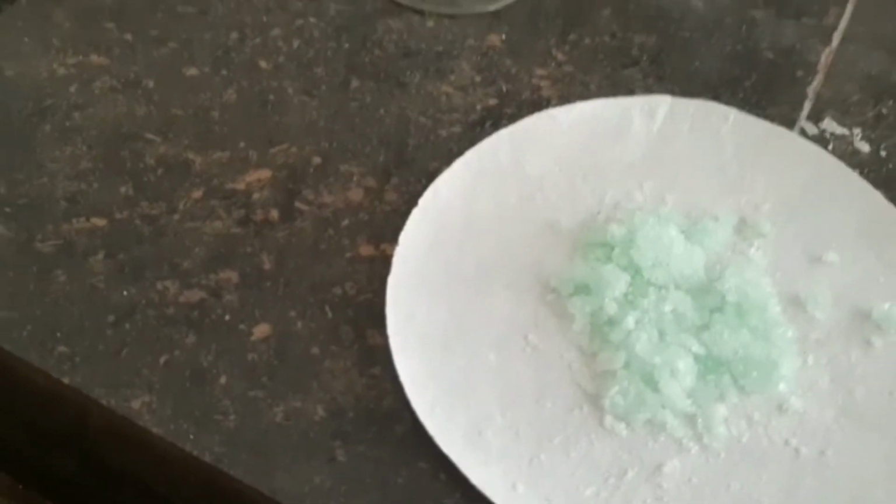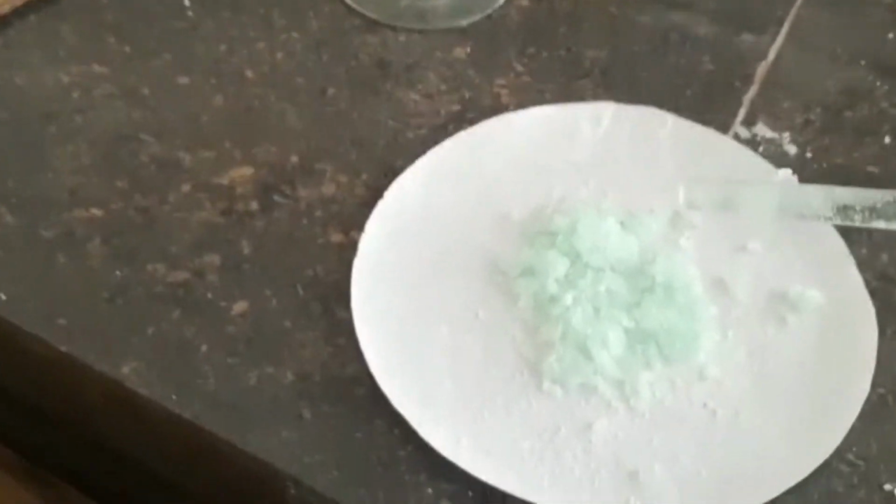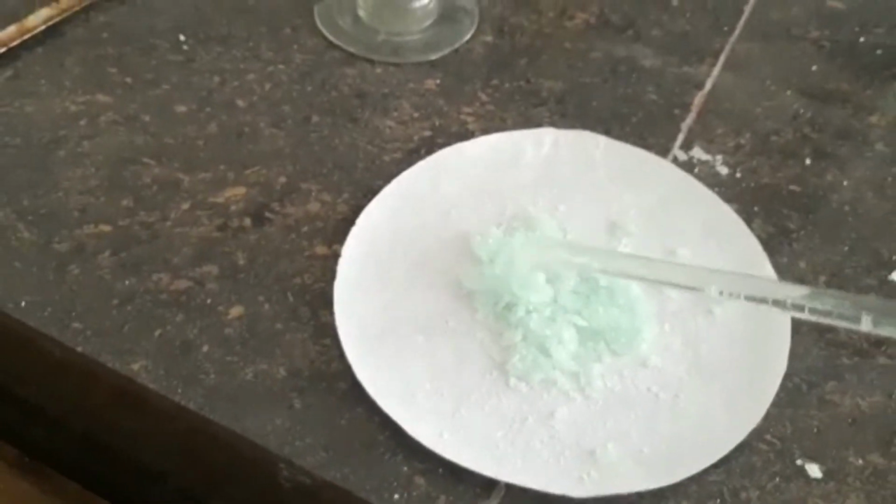So the crystals, these are the crystals after one day. Mother liquor has been removed.